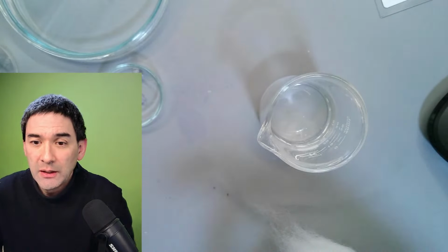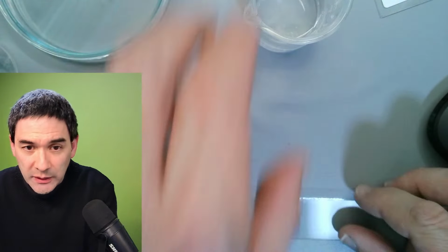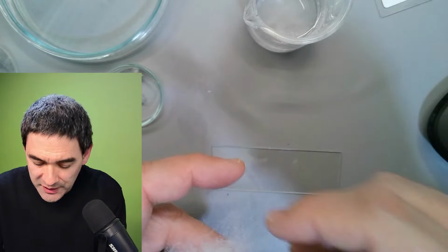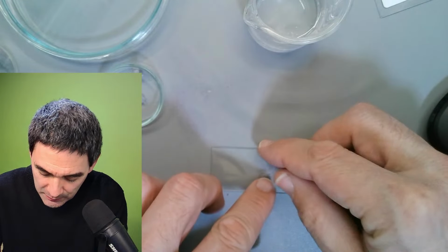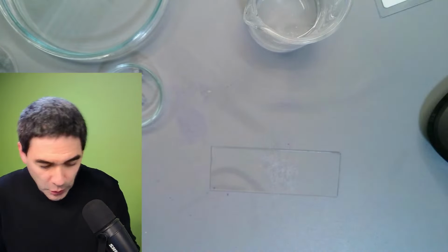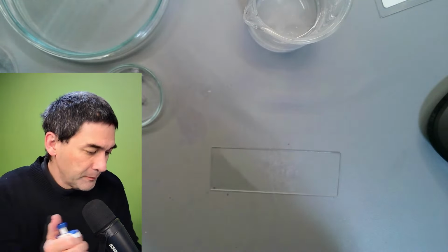So let's do the following. Let's put a few things here as well. Let's start off with this one over here that says just some regular cotton. As always, I put a little bit of cotton here. I also always want to use a clean tip.